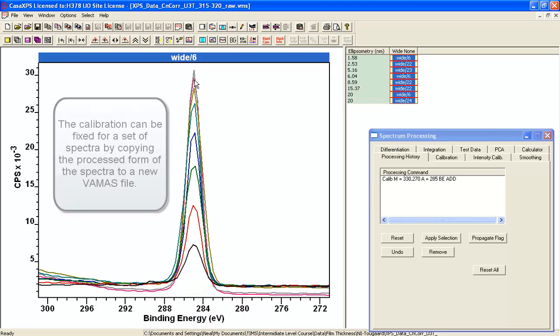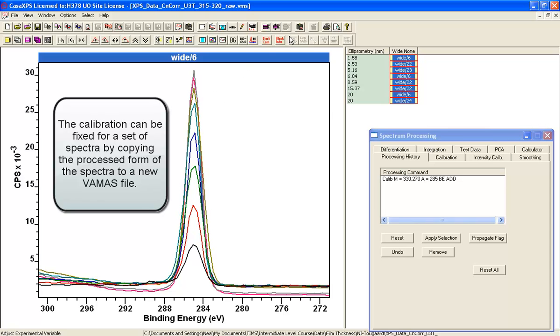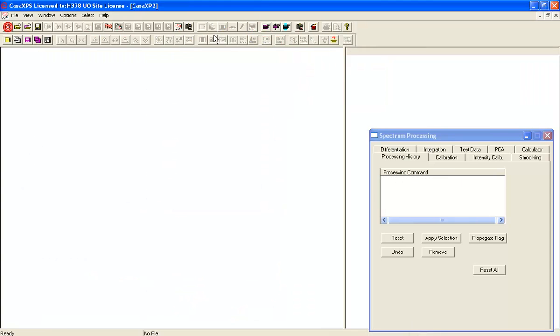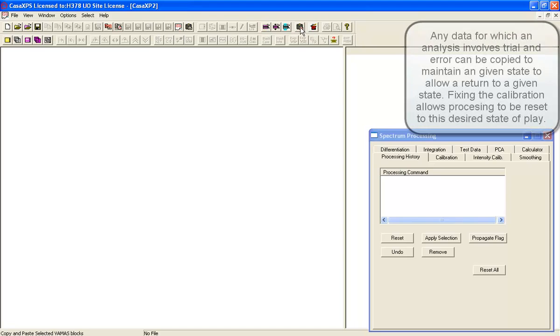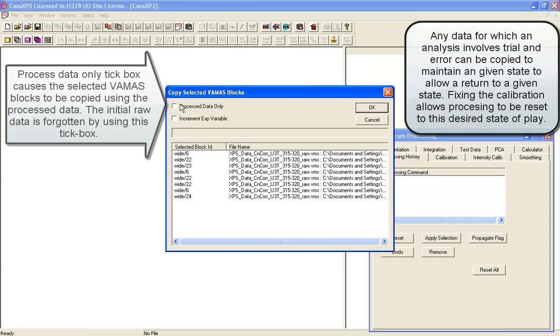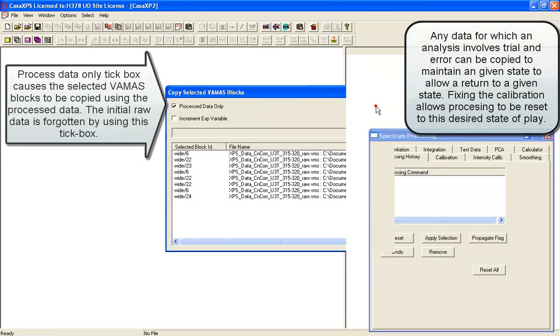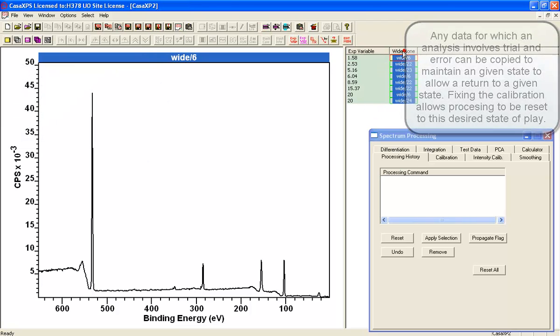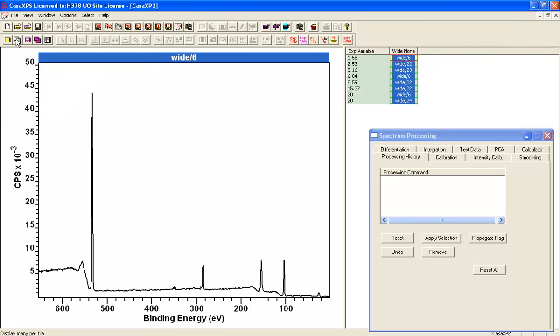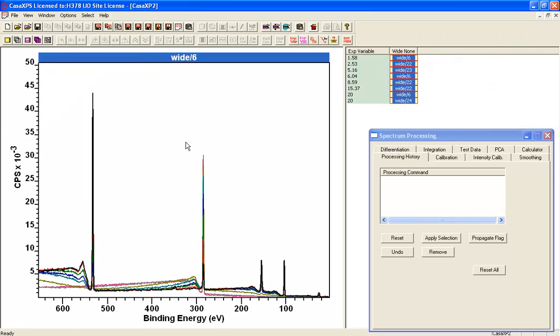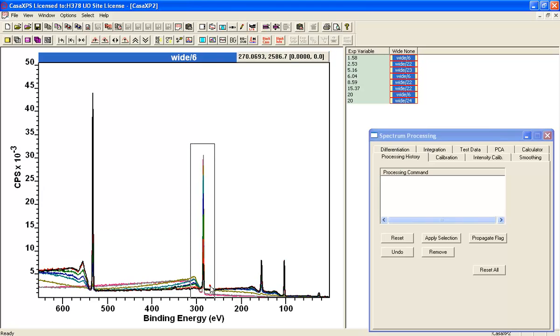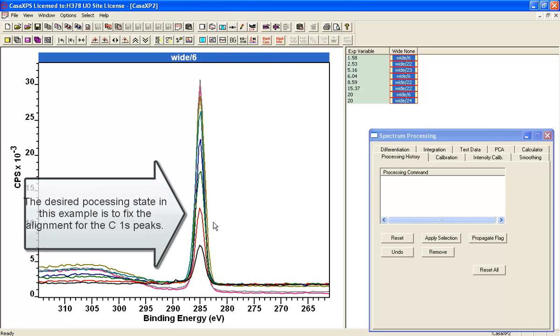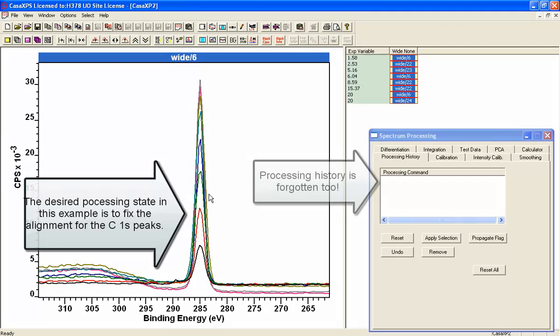And just to make sure that I retain the calibration, I'm going to take a copy of these in a new file. And I'm going to take the process data only. So now I have a set of spectra that have all been aligned based on the carbon 1s spectra, and they have no processing history. In other words, they've all been shifted.